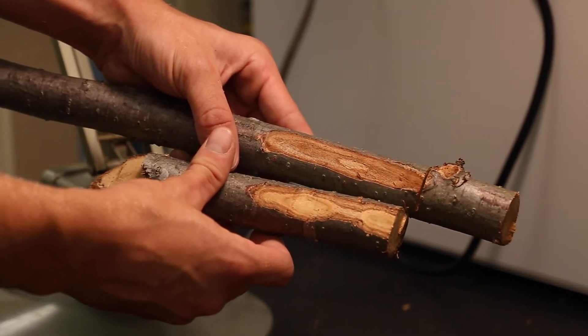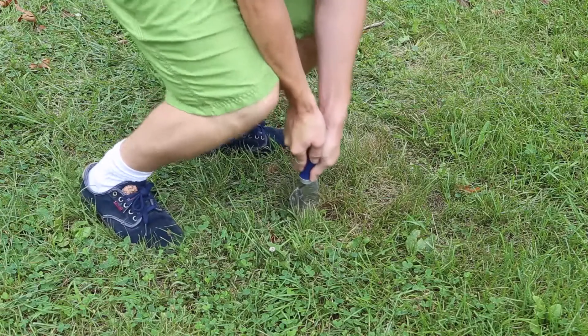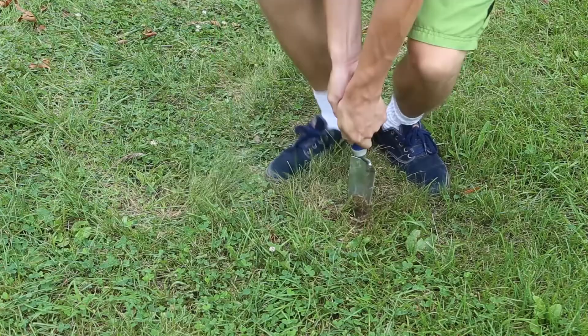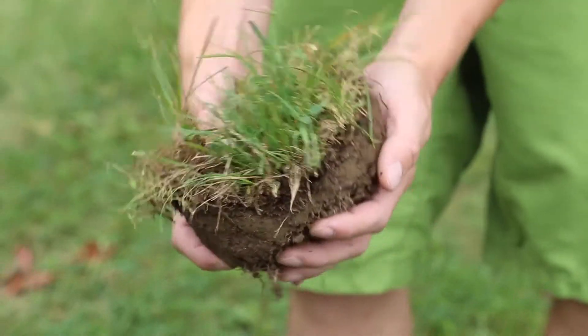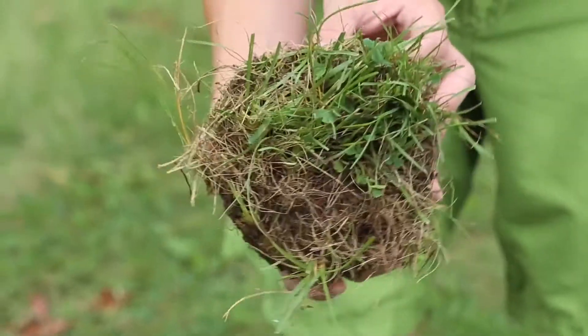Be sure to include this exposed branch with the rest of your samples that you'll be sending in. When submitting turf samples, cut out a circular chunk of grass about four inches in diameter, being sure to leave about two inches of soil connected to it. Make sure that you include both healthy and diseased grass in your circular sample, as this is crucial to the diagnostic process.